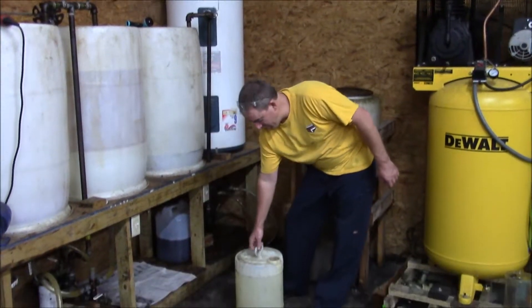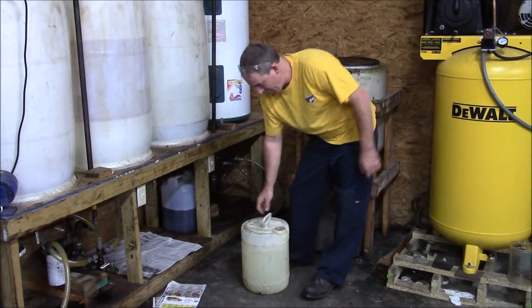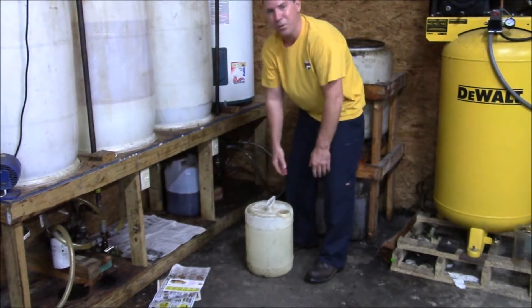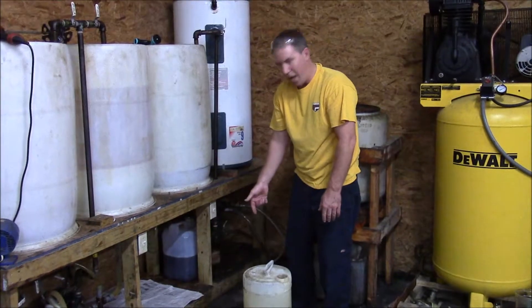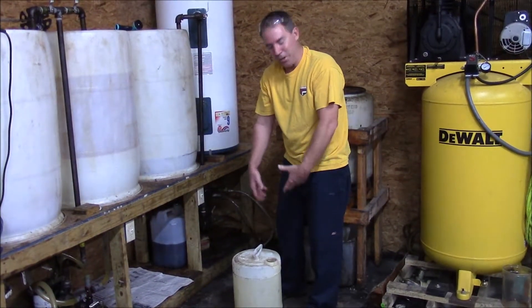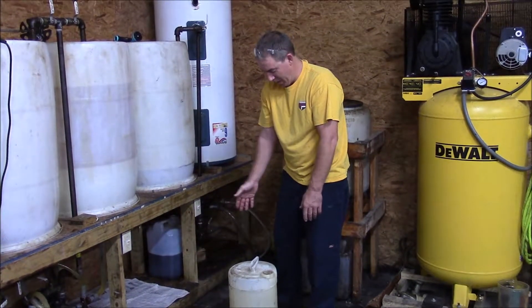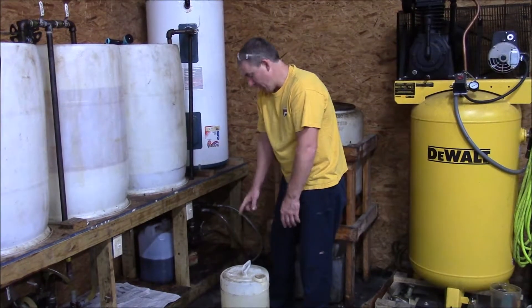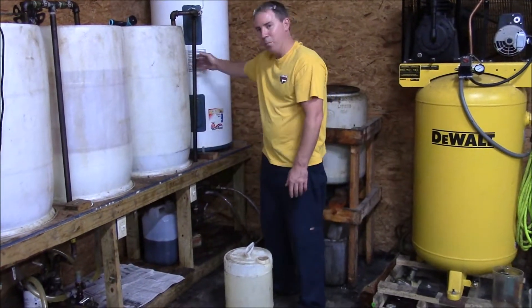Now that we have the sodium methoxide all mixed up, you can tell this container is getting warm because this is an exothermic reaction when you mix the lye and the methanol together. We make sure to mix it thoroughly and now that we've let it sit for about 20 minutes or so, we're going to go ahead and bring the product into the processor.